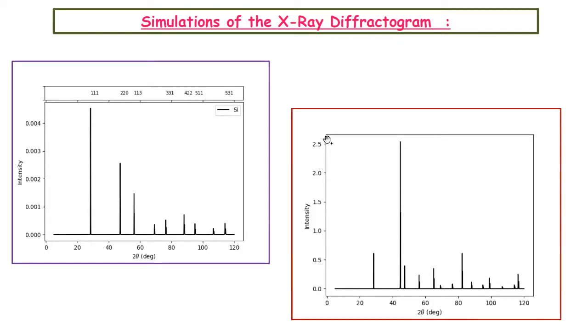So these are our very preliminary results that yes, if I know my material, it is possible. Again, I use ready-made toolkits available on the internet. I just mix and match them. And then it is possible that if you have silicon, this is the XRD spectrum that you expect. This is one of the compounds that Rajesh studied for his doctoral thesis. So yes, in principle, we are at a stage where we not only can tell you after performing the experiment what your spectrum should look like, but we can tell you even before what you should expect. And any deviation from that will make you sit up and look at them more carefully. So that's a small two cents worth of value addition in this big picture.